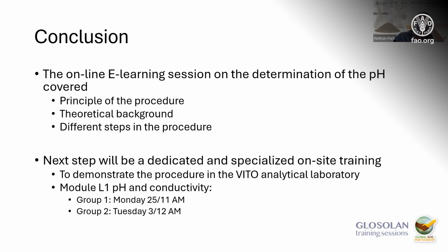But does the whole batch get redone? Like, you're doing what, 10% duplicates? Normally we don't redo a whole batch as long as we see that the buffer verifications are okay. Then you can say the measurement is okay. But often when we report the results, we mention it, or we report the duplicate results, that we see that there is a higher deviation, and we mark it in the reports. Okay, so it all seems done procedurally. Every deviation that you see, you mark on your analytical report.